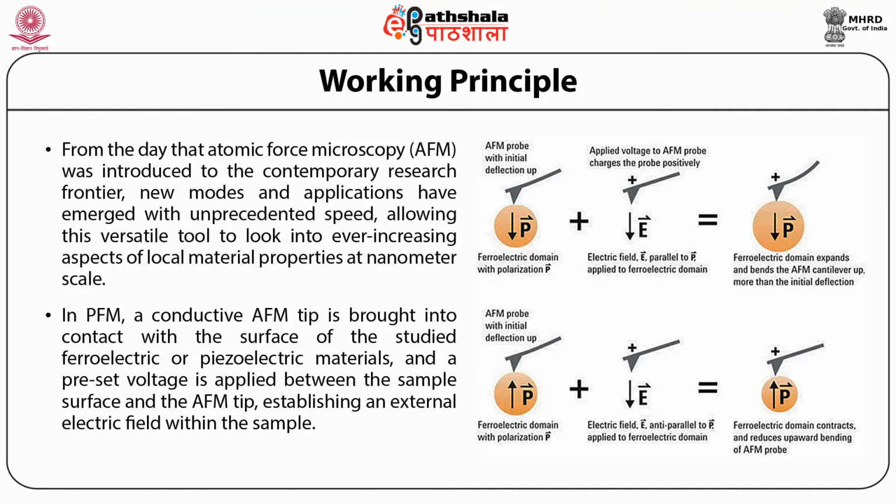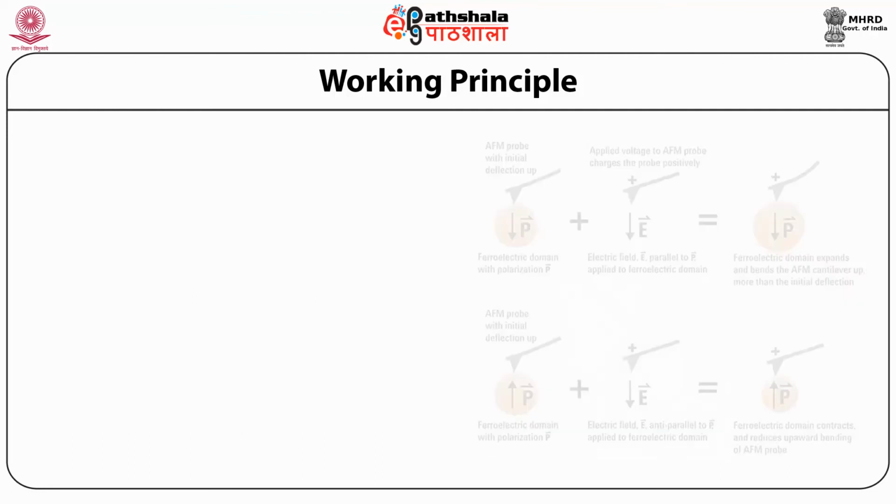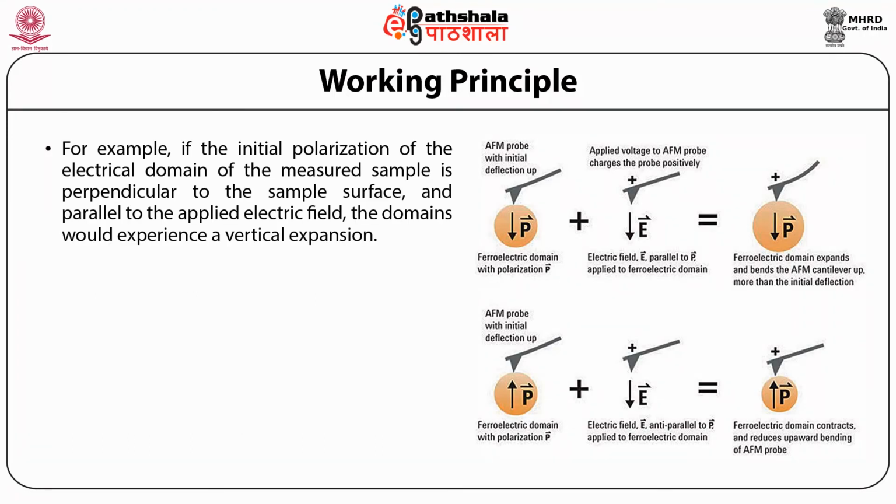So, due to electrostriction or inverse piezoelectric effects of such ferroelectric or piezoelectric materials, the sample would locally expand or contract according to the electric field. Now, if we take an example, if the initial polarization of the electrical domain of the measured sample is perpendicular to the sample surface and parallel to the applied electric field, the domains would experience a vertical expansion.